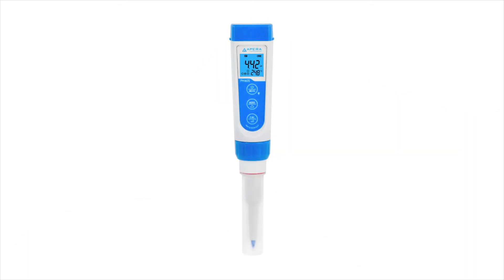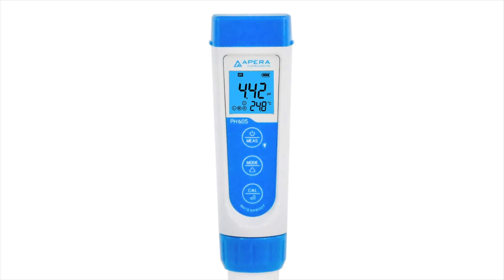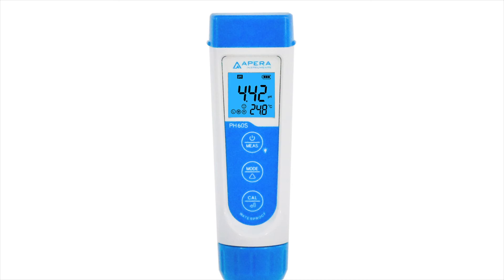Next time you use the meter, the heads up function will be available and you will be notified when the pH of your sushi rice is over 4.2 by a red screen.